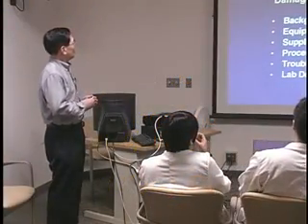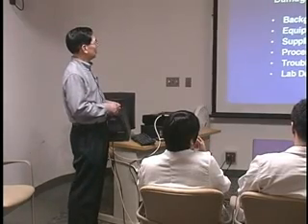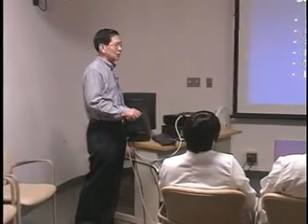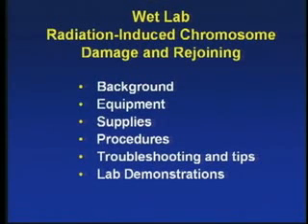So we're going to proceed with today's wet lab that deals with radiation-induced chromosome damage and rejoining. And we'll go through the same sequence of outlines as we did before. Start with a little bit of background on chromosome aberrations and their relationship to dose response.